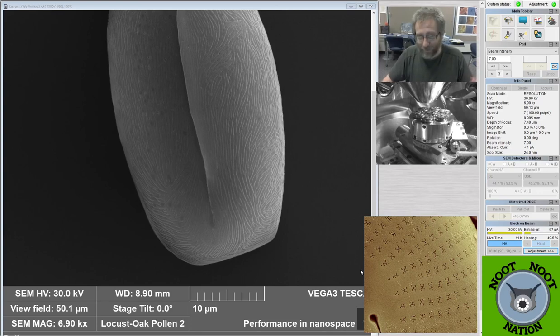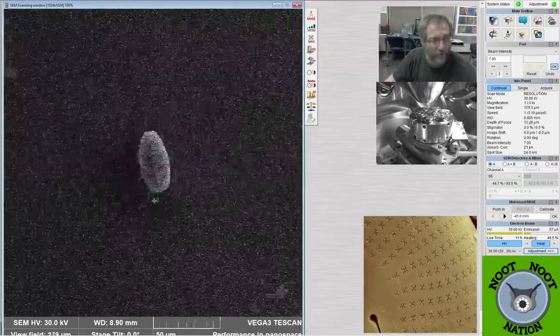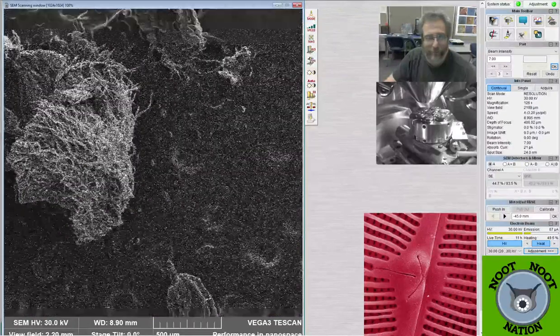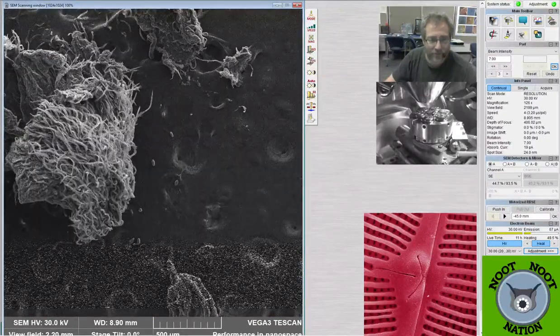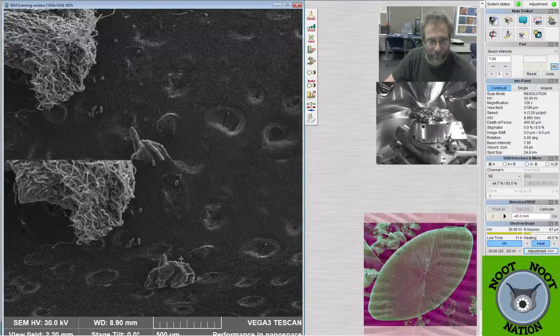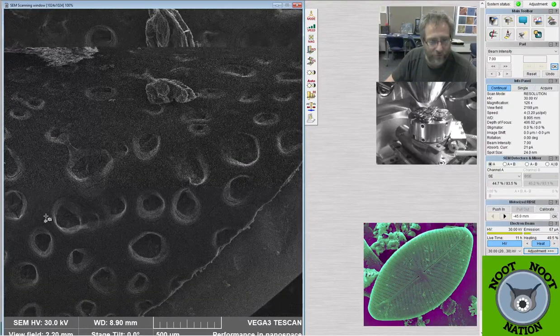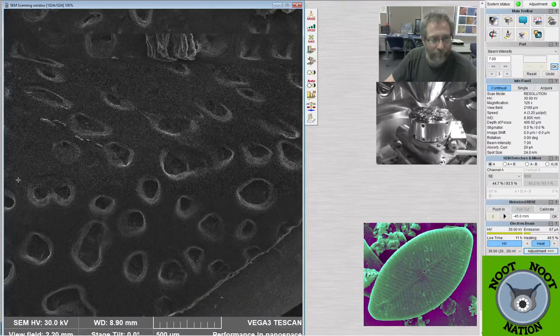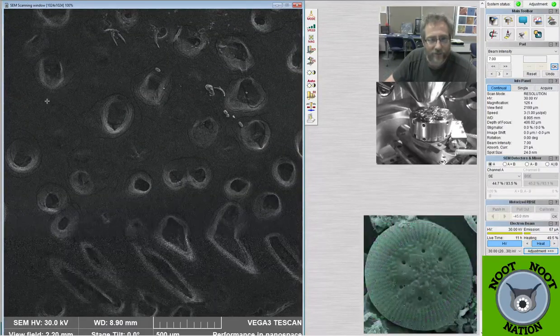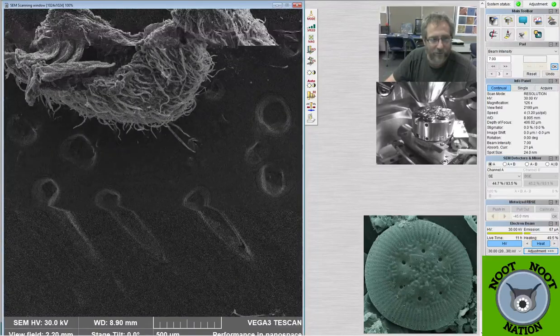And today we're looking at pollen, even though it's not the thing that I study. But I do see pollen, and I think it's a useful thing for me to get familiar with phytoliths and pollen and ostracods and any other microscopic thing that I might run across in a sample. So I mentioned I smashed two bits of an oak, I think, and a honey locust, onto the stub together. And we looked at one of them, which I guessed was the honey locust.